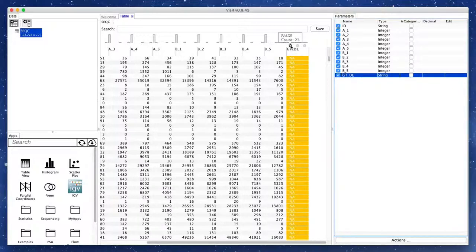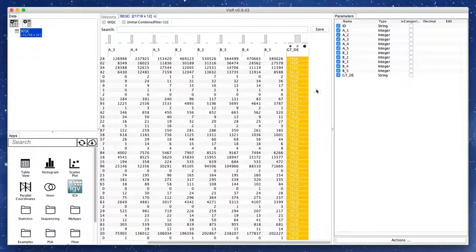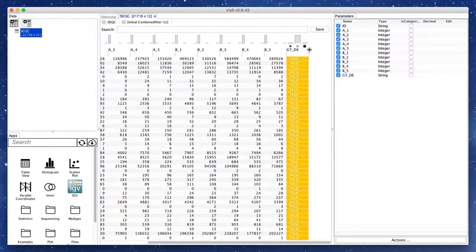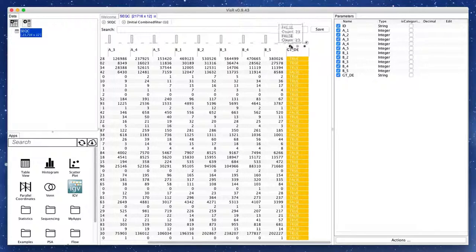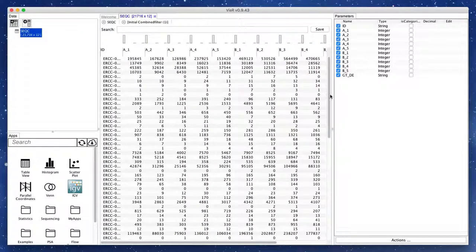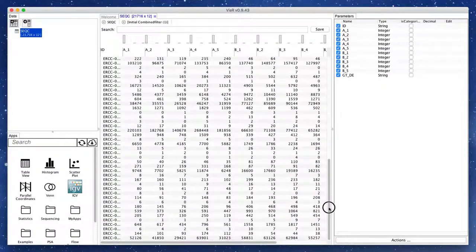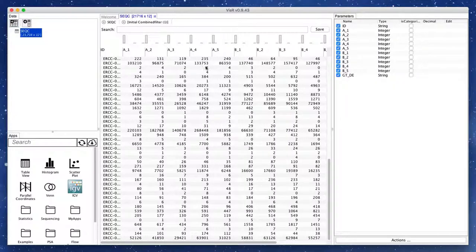The column labeled GT_DE shows the ground truth differential expression state for the spike-in genes. Spike-in genes that are known to be differentially expressed between two biological conditions are labeled true, and those that are not differentially expressed are labeled false. All other genes with unknown state are labeled NA.